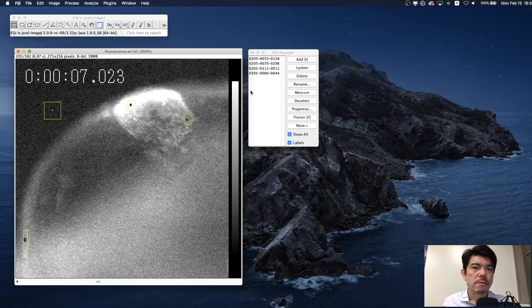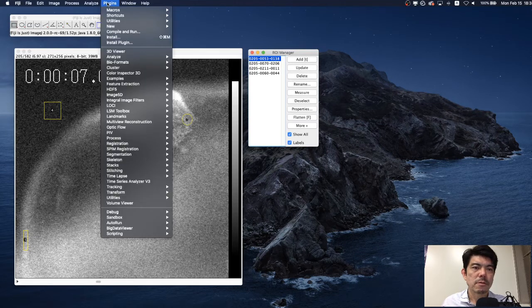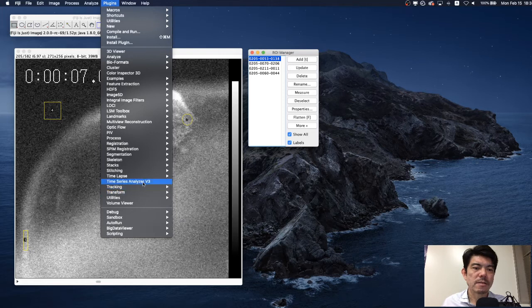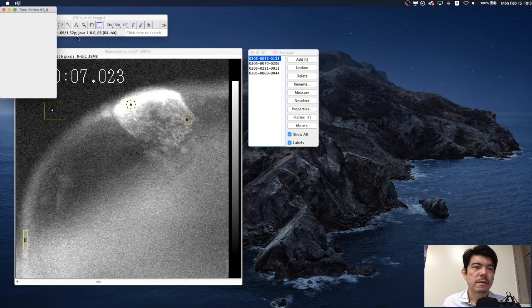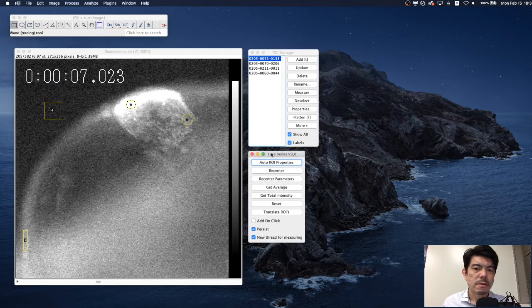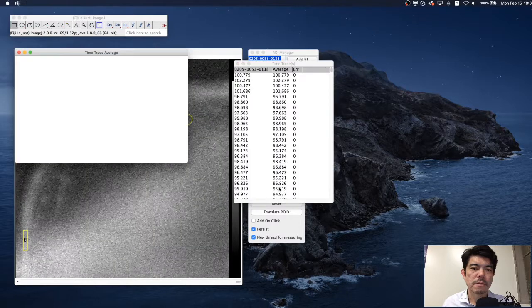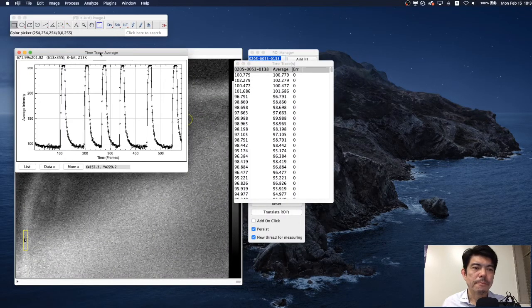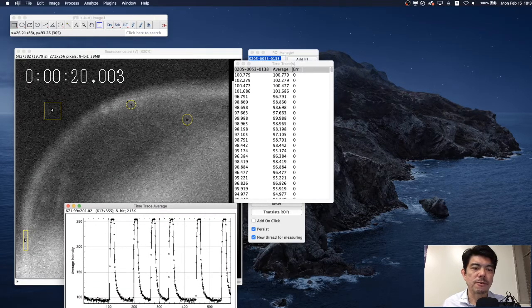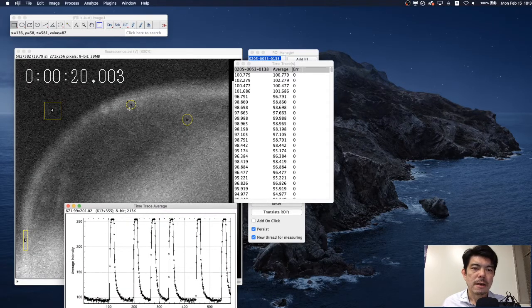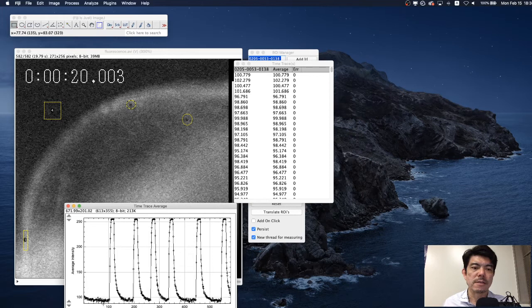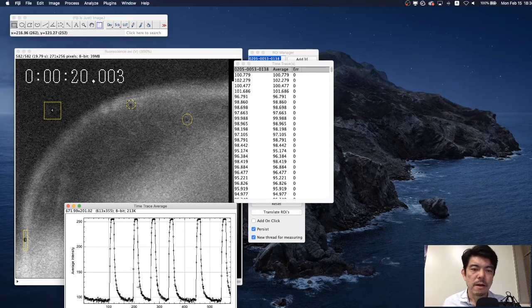Alright, now we choose one of these ROI and go to plugin, Time Series Analyzer, and press get average. Cool, isn't it? Now this graph shows the fluctuation in the intracellular calcium level within this ROI. Basically the intensity of the signal is averaged inside this region of interest and this is the quantified result.